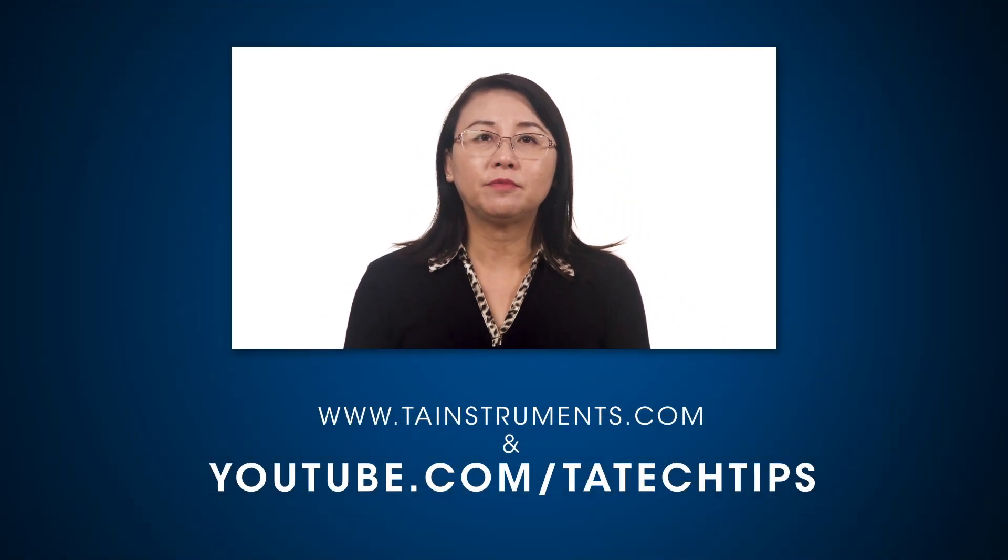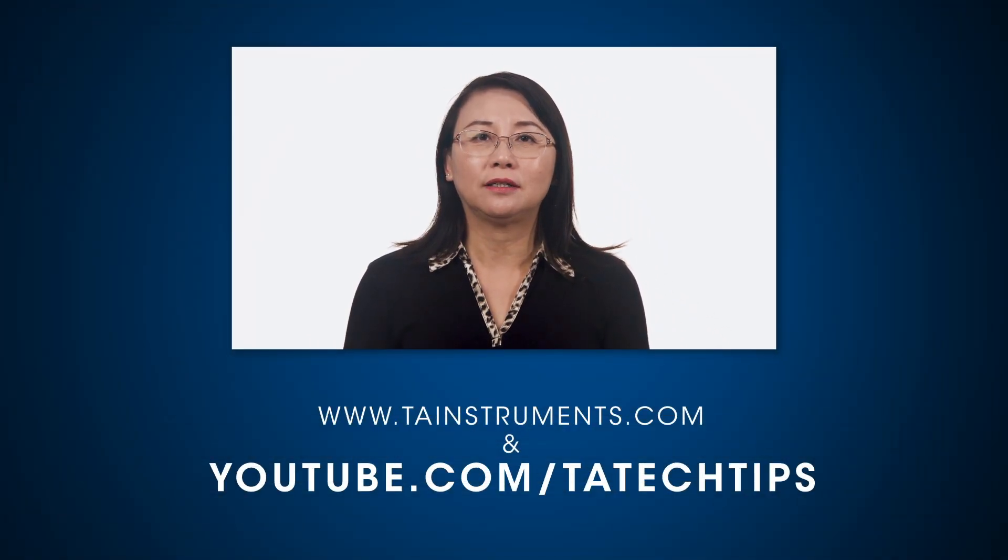In this TA Tech Tip, we have demonstrated how to set up and use the annular ring geometry with the DHR-RH accessory. Please stay tuned for more TA Tech Tips and thank you for your interest.